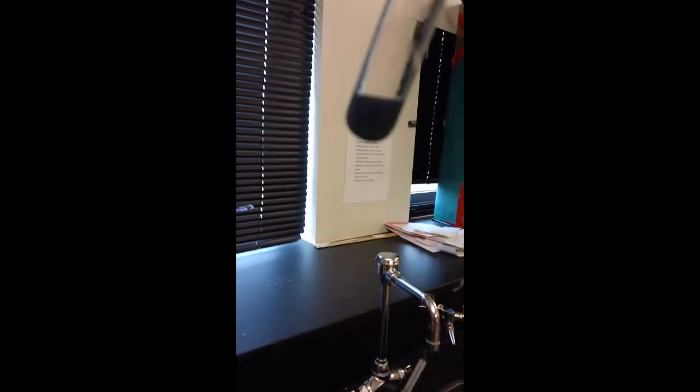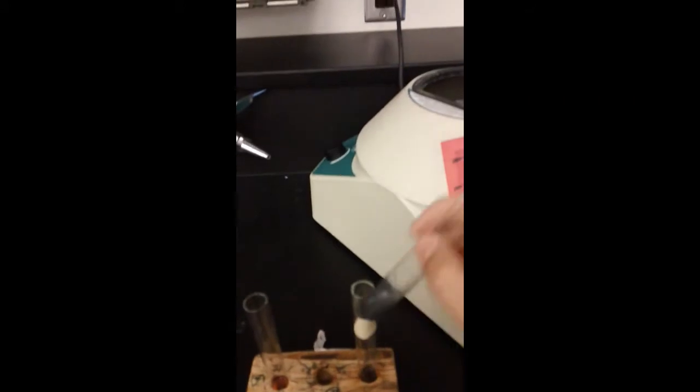Okay, so let's look to see what we got. Ooh, we went from that red, now look what it is. That's test C. We've added 5 drops of NaOH. So now we need to centrifuge. So we're going to go over and centrifuge, and I will stop recording and come back when we have centrifuged.